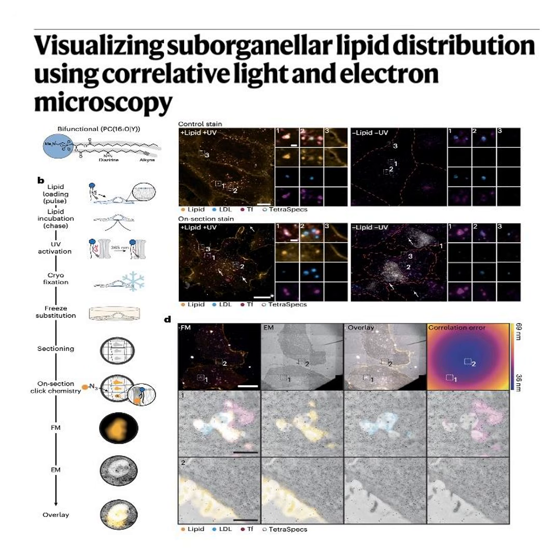Signaling clusters at the plasma membrane, the intricate lipid rings around nuclear pore complexes, the junctions of mitochondrial cristae. This workflow is the first concrete step toward building a true, comprehensive consensus model of biological membranes. It completely redefines the landscape of cellular research. And as we close out today's deep dive, I want to leave you listening with a provocative thought that builds on what we've just unpacked.